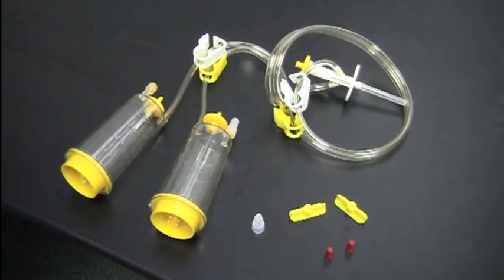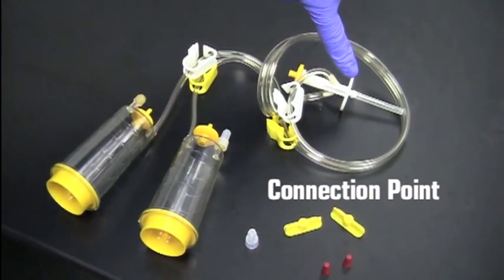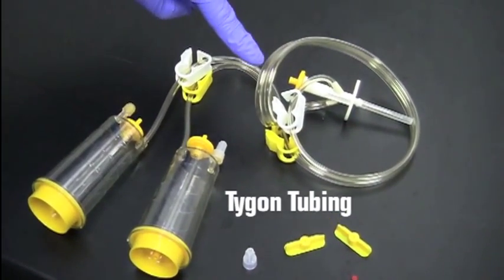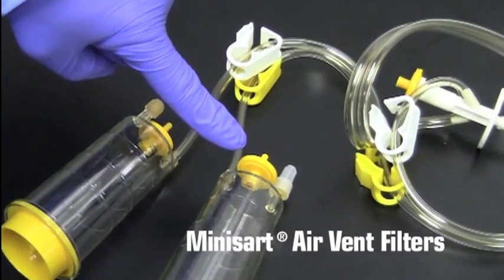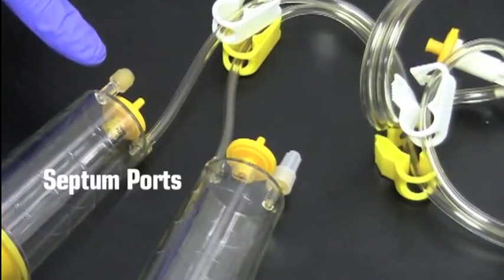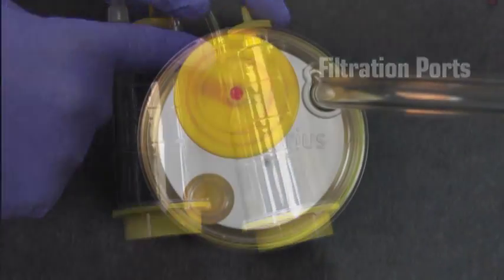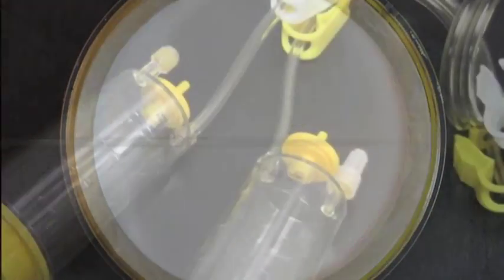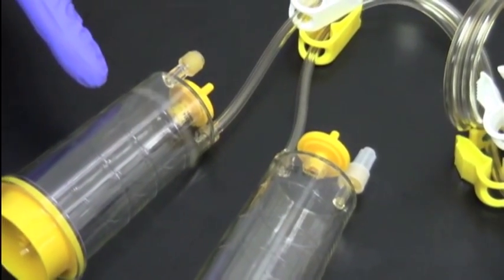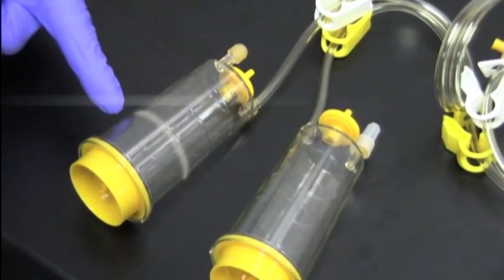The Sterisart NF canister consists of a connection point, Tigon tubing, tube clamps, MiniSart air vent filters, septum ports, filtration ports, and inside, the Sartorchem membrane. The integrated canisters have level indicators at 100 ml, 75 ml, and 50 ml.